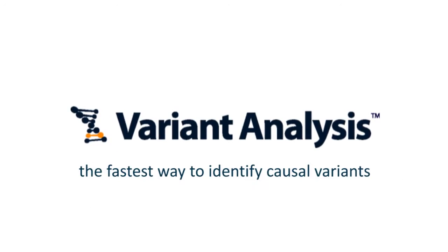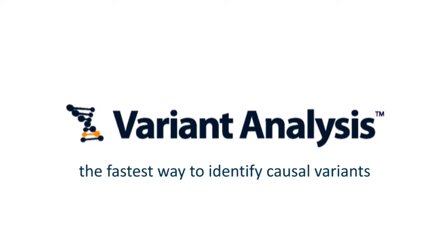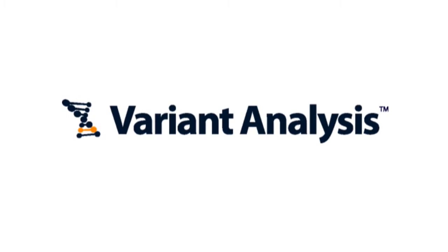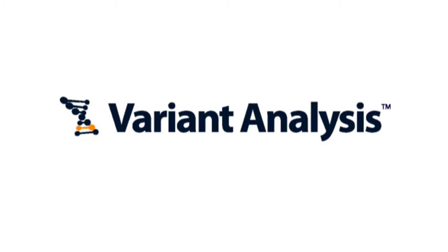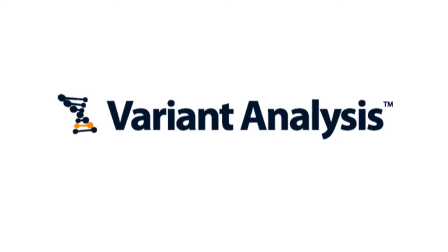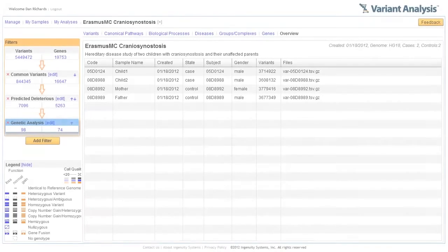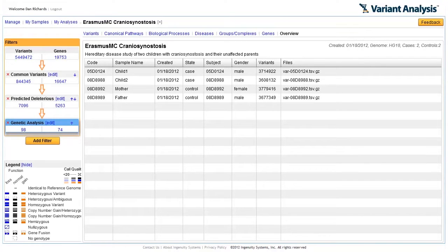Ingenuity variant analysis is the fastest way to identify causal variants by providing a single integrated source for both genetic and biological analysis. It quickly identifies scientifically compelling variants for you. This allows you to focus on the biological significance of your data. Let's have a look at the features of Ingenuity variant analysis that can help you do this.